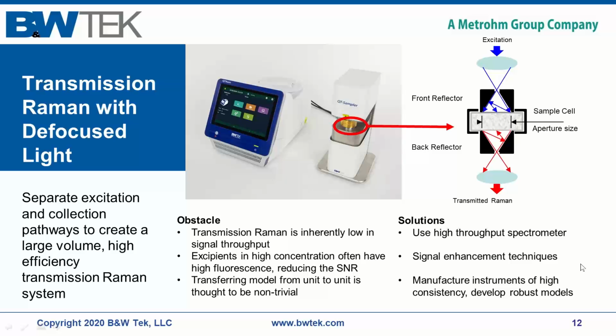So because we're doing a transmission measurement, we should keep this dimension similar, because this will be related to how much light and how much material we're sampling at the same time. But if the diameter is different, that should not be problematic, because our spot size will be the same. So it is really the thickness dimension that would be a challenge and would introduce variability in the measurements that you would want to minimize. Great, thank you for confirming that.